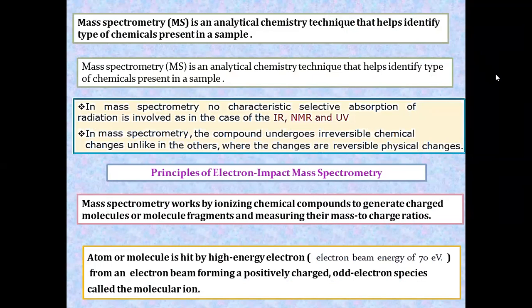What we mean by mass spectrometry is that we have a molecule of a compound, and this molecule undergoes degradation, forming a type of fragment, and we accumulate these fragments in order to reach the acceptable structure of our chemical compound.